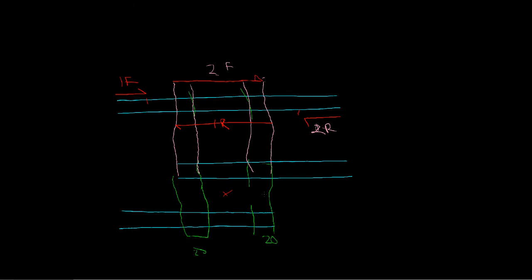So we have our homology right here. So this oligo has homology to that template there. So this is going to extend that way in order to give us this. And it's going to bring along whatever is behind it, this whole chunk right here, for the ride. I should probably use a different color. It's just going to bring along its caboose for the ride, so the back part of it, the 5' part of it. It's coming along no matter what.